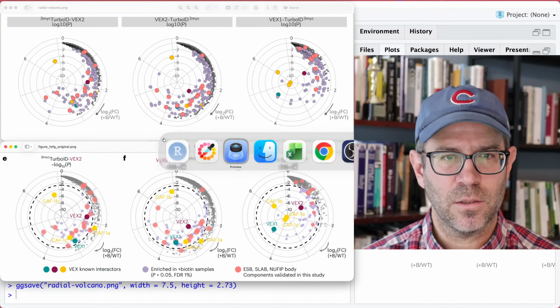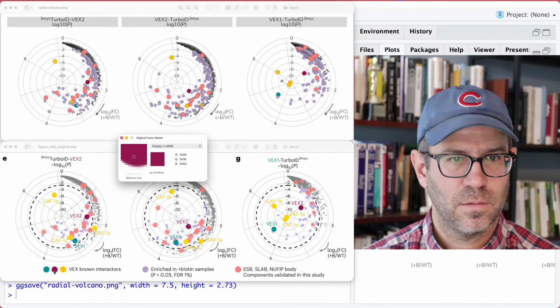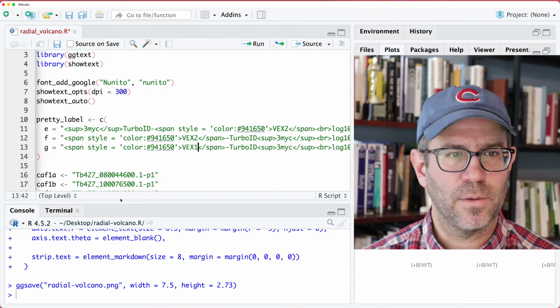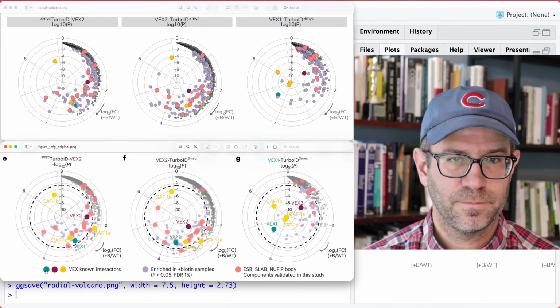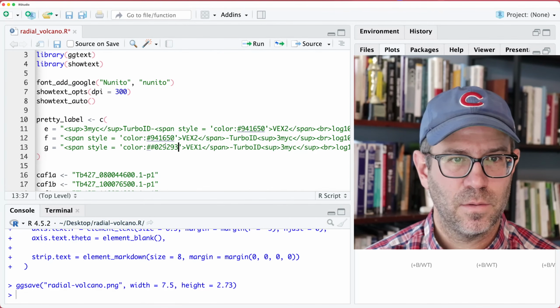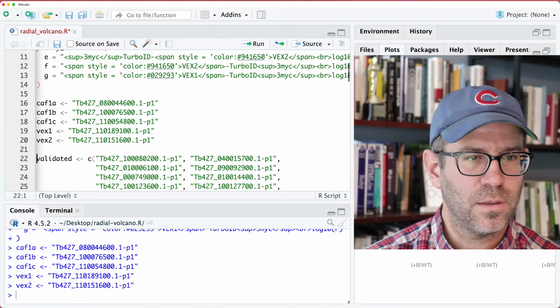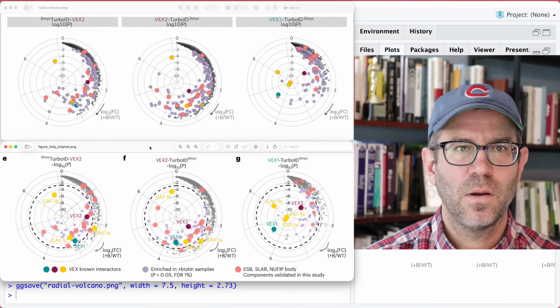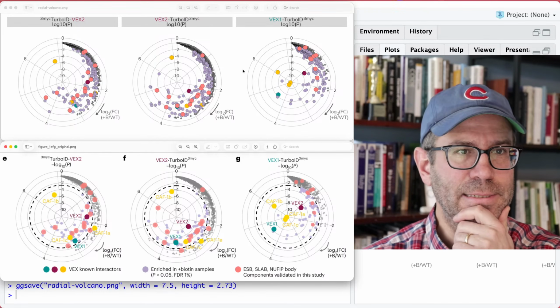So I need to get the right colors. And so vex2 is the burgundy. Right, it's actually already this, right? That's right. So it's the vex1 I need. And that is this teal. All right, and then remove that extra pound sign, and then get everything all loaded. And then we now see that we've got those labels. Cool, right?